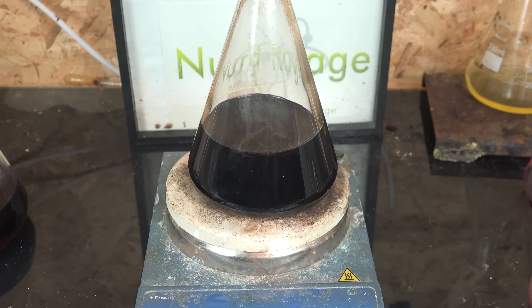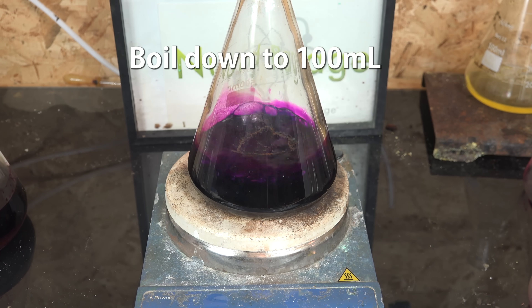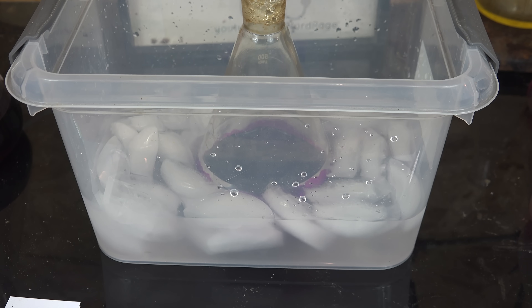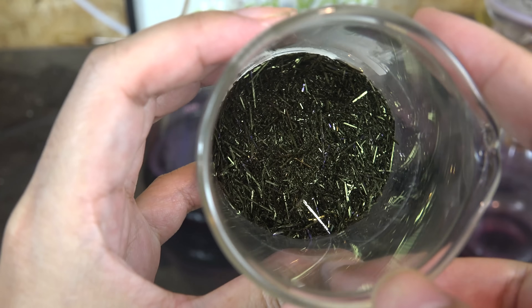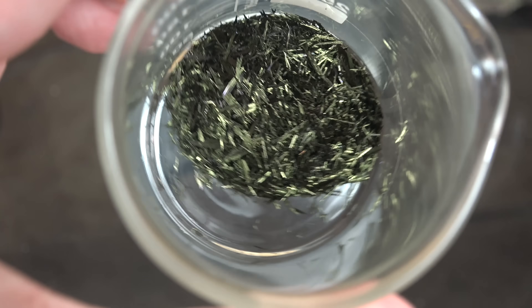Remember the 300mL of filtrate? We can recover additional potassium permanganate by boiling it down from 300mL to 100mL, then chilling on ice before suction filtering one more time. The final yield is 25g for the first crystallization and 5.7g for the second.